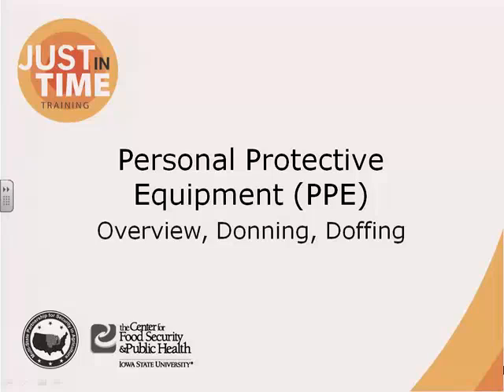During an animal health emergency, hazards from zoonotic diseases or chemical exposures may occur. The use of personal protective equipment, or PPE, can protect you from these exposures and help prevent the further spread of pathogens to other animals, personnel, or premises. This just-in-time training presentation will overview the use of PPE and proper donning and doffing procedures. Safety considerations while wearing PPE will also be addressed.